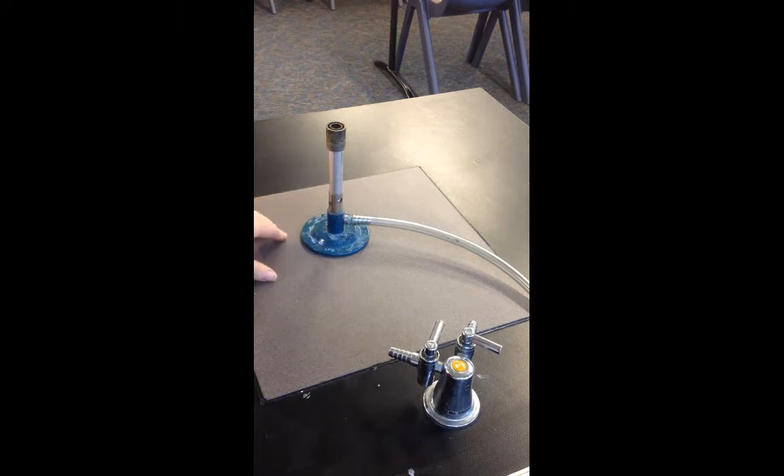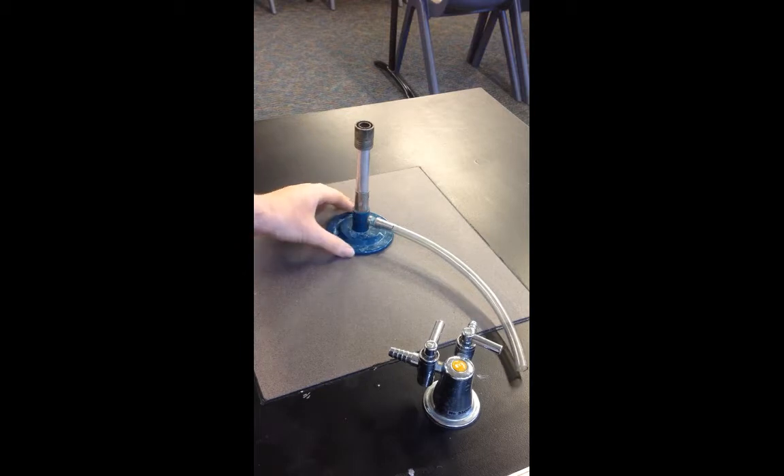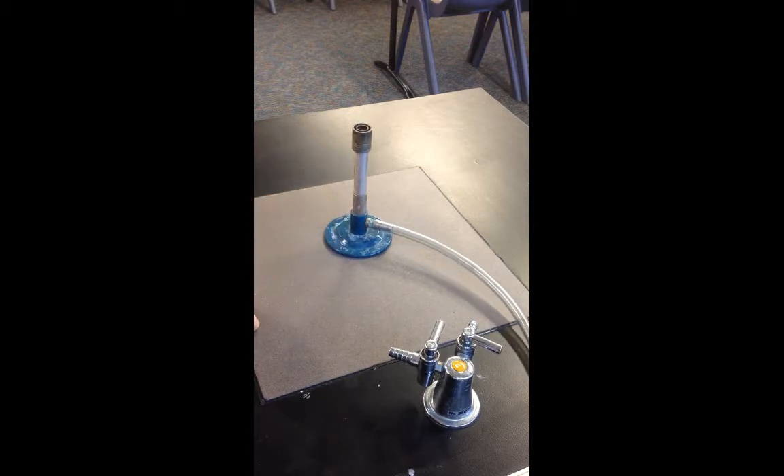We can open the holes on the collar so that more oxygen can get in from the air. We can close the holes when we want the flame to be less fierce, and open the holes when we want the flame to be hot.